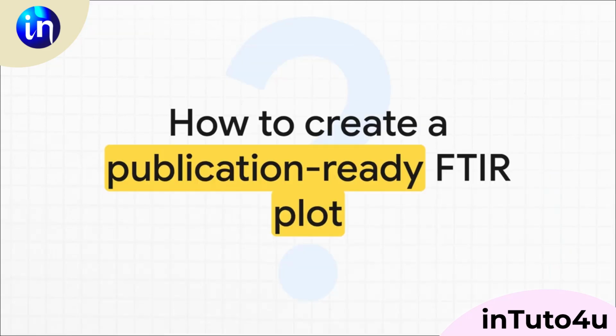This right here is the big question, isn't it? You've already done the hard part. You ran the experiment, you got the numbers, but how do you make those numbers tell a clear visual story? We're going to walk through the whole process step by step using the awesome software Origin.